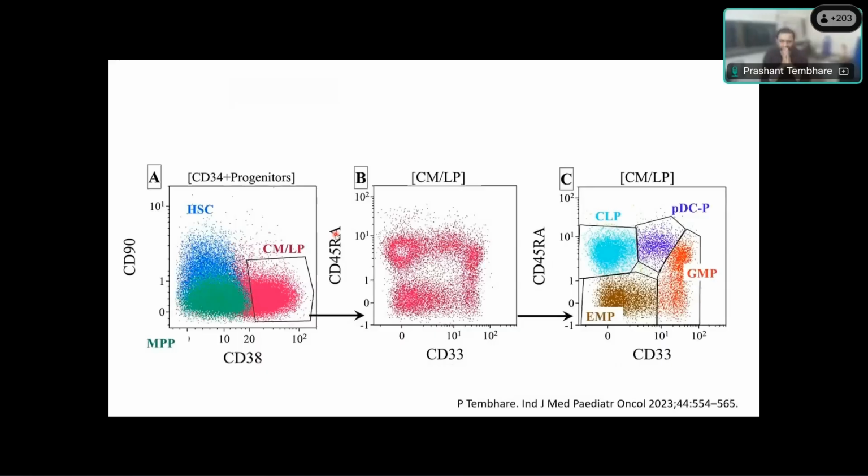Now, before that, let me explain how to interpret these dot plots. Okay. Now, this is a dot plot. Why is this a dot plot? Because we are looking at dots here. Now, each dot is considered an event, when you say event, this is equivalent to a dot. Okay. Each dot represents an event, and by and large, the majority of events are considered a cell. So each dot represents each cell. Okay.